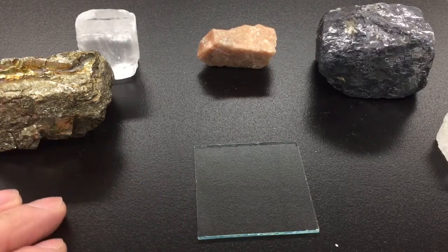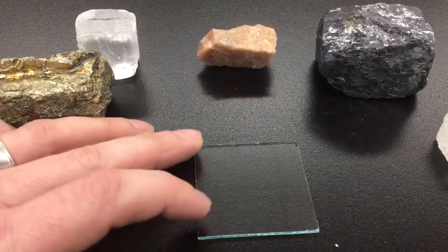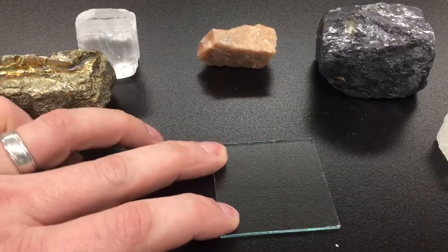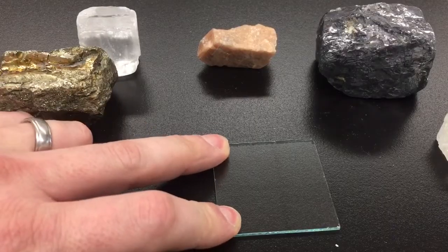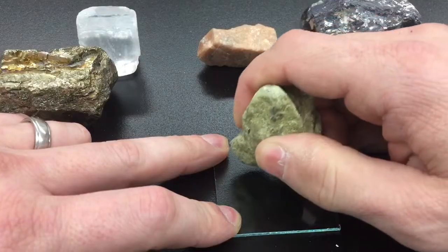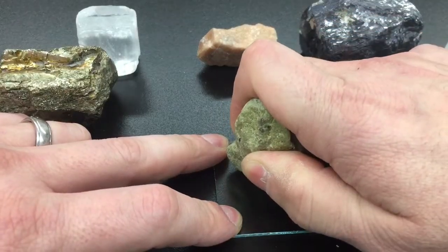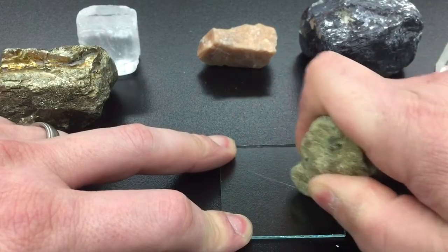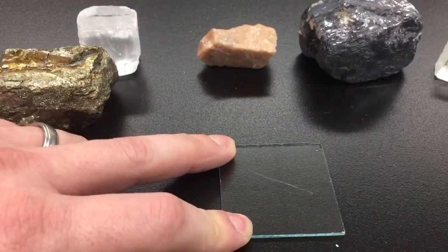When testing the hardness, please be careful. Place the glass plate firmly on the table and hold it down with a couple of fingers on one hand. Take the mineral sample in your other hand, press down pretty firmly against the glass, and make a short scratch in the glass.